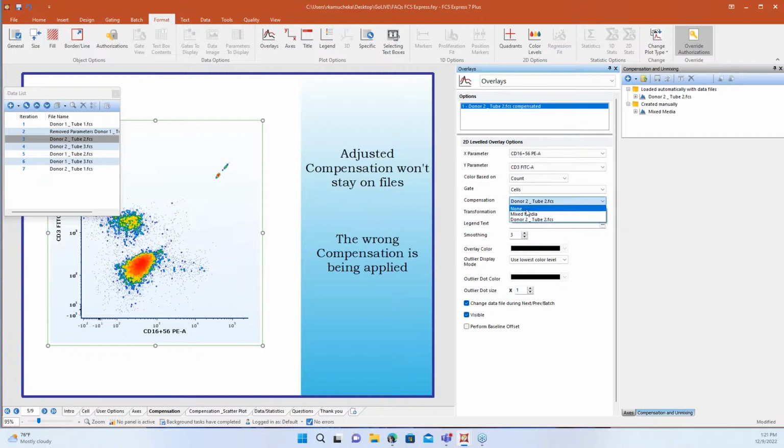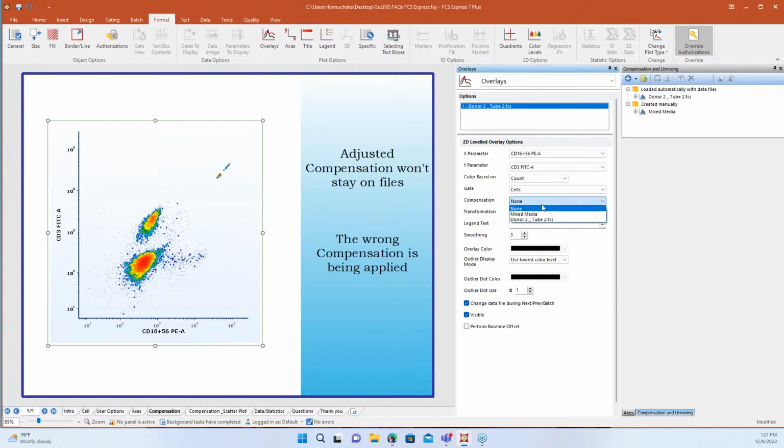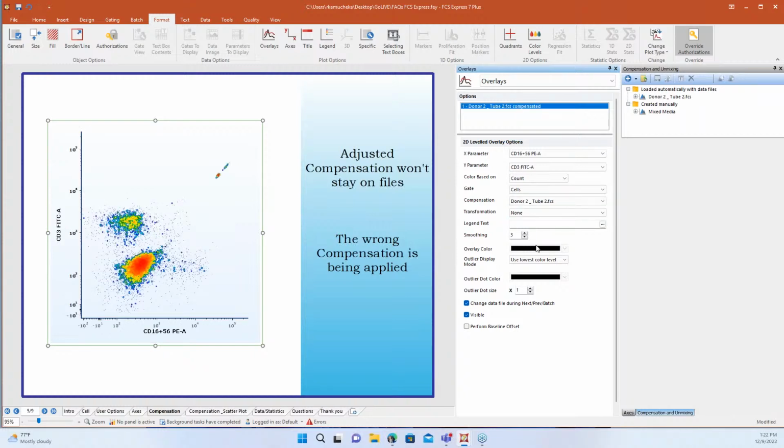And if you have other compensations, you can use your drop down plot, but you do want to make sure that if it's something that you did modify manually, it's set to default, because otherwise you'll run into the same thing. You'll move to the next data file and it will update for you to whatever the default behavior is to use compensation. Yep. And that's a nice way to do some comparisons between your comps as well. So maybe most people are calculating compensation at the instrument, but maybe you don't like the way that looks, or maybe you want to do a more mixed media option that's not as easy to do on your instrument. Using this drop down here is a good way to flip through the different compensations you have to see which one is going to work better for you.